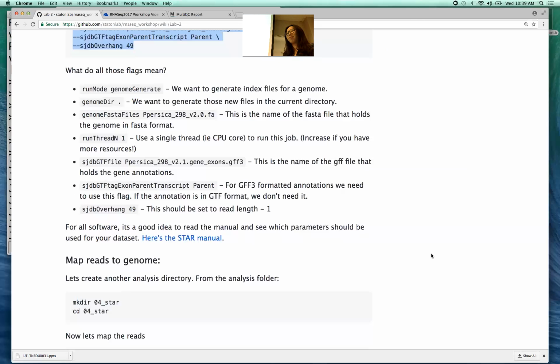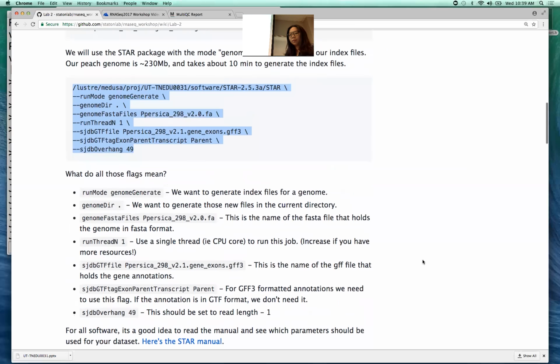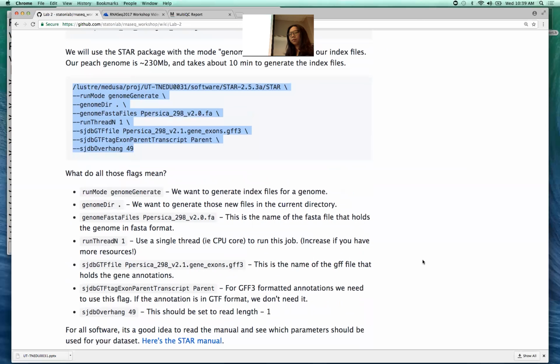But it relies on most of the bases matching. And that's why we give it the location of the genes, because our reads are going to be split between exons. Our reads can cross an intron boundary, so the software is smart enough to create words that cross over the intron. That's why, if we want it to be really accurate and efficient, we need to tell it where the genes are. It's also going to preferentially map to words inside of genes.